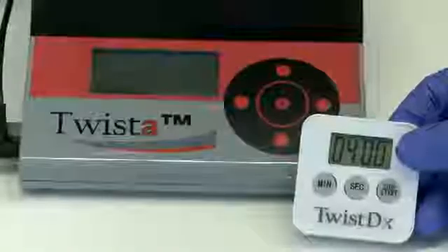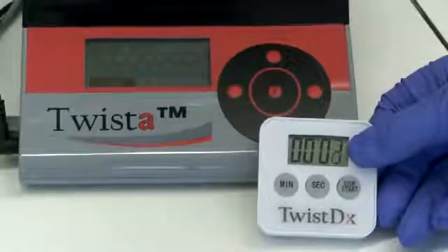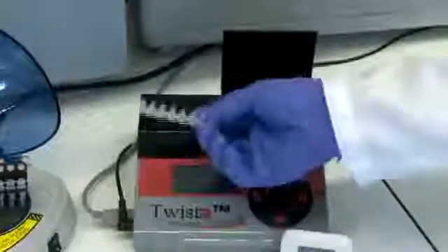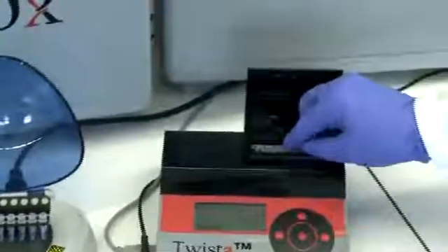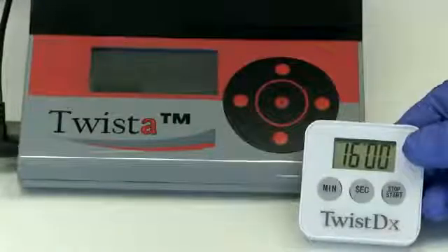Start a timer for 4 minutes. After 4 minutes, remove the tubes and vigorously invert 8 to 10 times to mix. Centrifuge and replace into your heating device. Continue incubation for a further 16 minutes.